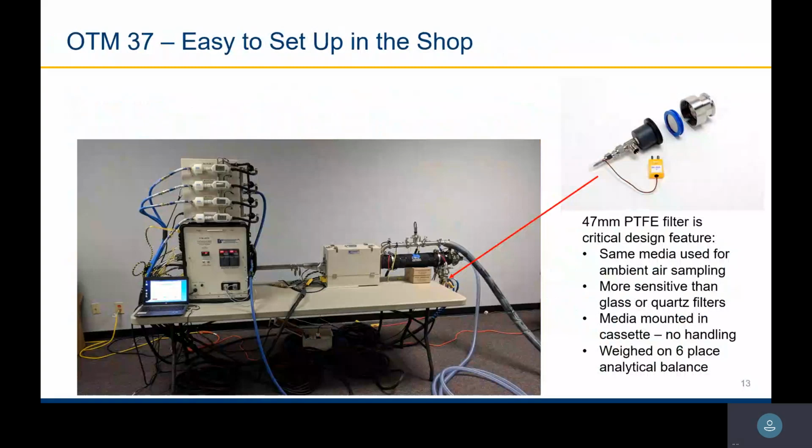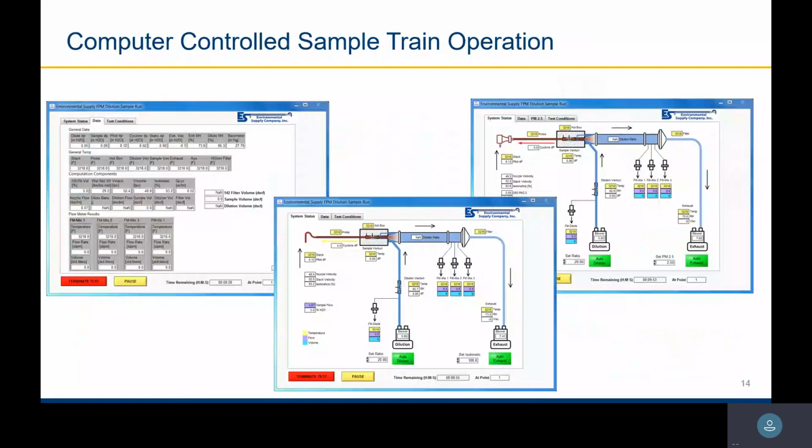The system is all computer controlled. The console here controls the flow rates. There's a large blower connected to this line here that's blowing in the clean ambient air, and a second blower on this line here, connected to the back, that's pulling the exhaust air out of the system. By balancing the ambient air in and the exhaust air out, they then determine how much flow is coming in back. So it's computer controlled. Once we get it set up, there's not much the operator does except monitor these computer screens to make sure that everything is within spec.